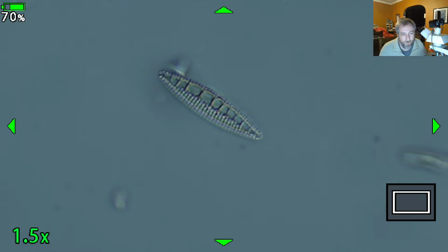very famous diatom taxonomist from the early days. And this diatom, I think you would probably agree with me, is either this thing or very close to this thing. Hang on, I will send a link. It's found on the Diatoms of North America webpage. Here you go. So you can check that against what we're actually looking at.